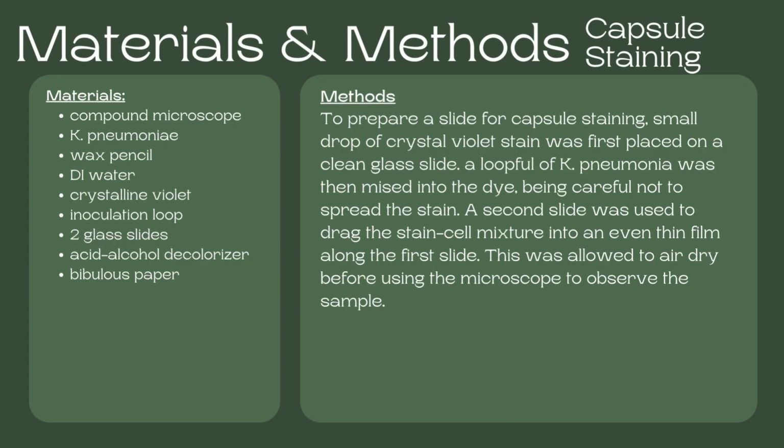For our capsule staining, we used a compound microscope, K. pneumoniae, a wax pencil, deionized water, crystal violet, inoculation loop, 2 glass slides, acid alcohol decolorizer, and bibulous paper.